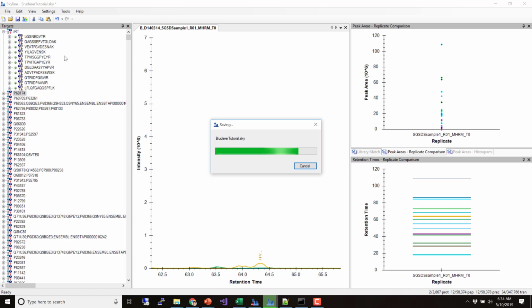So the only difference is, you created this, remember? Everybody at least gave a shot at creating this, and then you imported one file. Now I'm going to give you another document, and the only difference between it and your file is that it has a whole bunch of files imported into it. So it has the full 24 file data set. Hopefully everybody can get that open on your laptop.